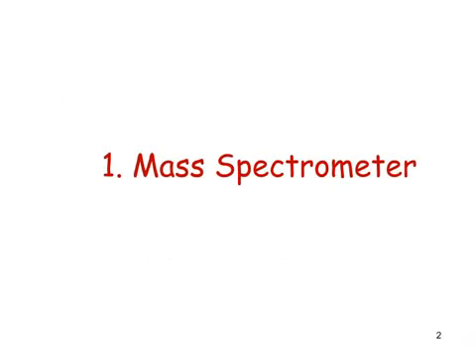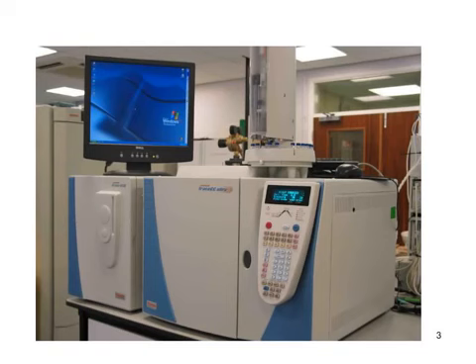So let's get on with mass spectrometry, or the mass spectrometer. A mass spectrometer looks something like this today. This is a modern mass spectrometer. You can see connected into a computer, which will show on the screen the graphical results, which can then be printed.